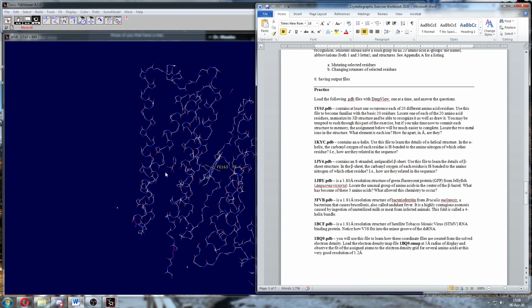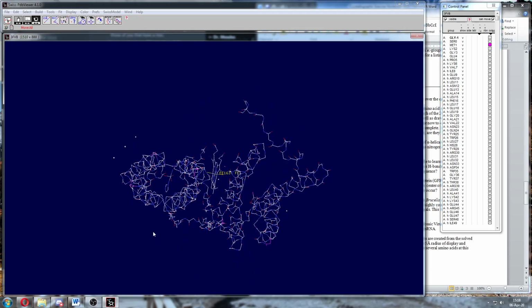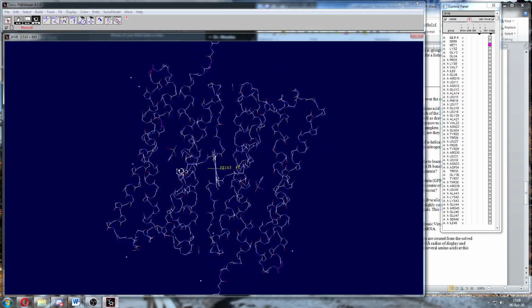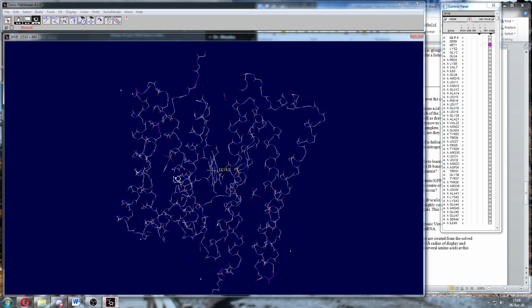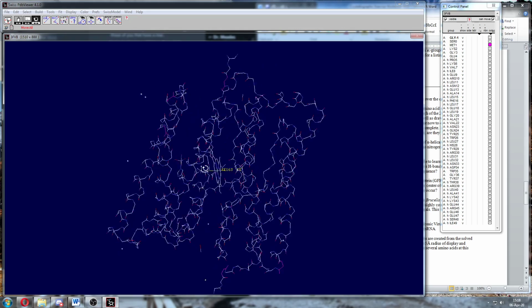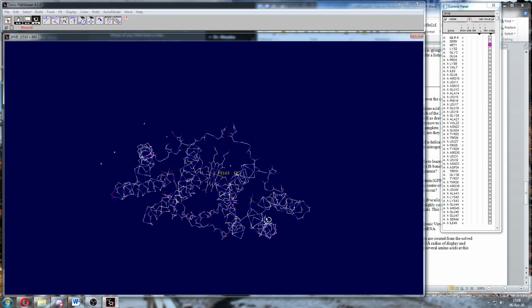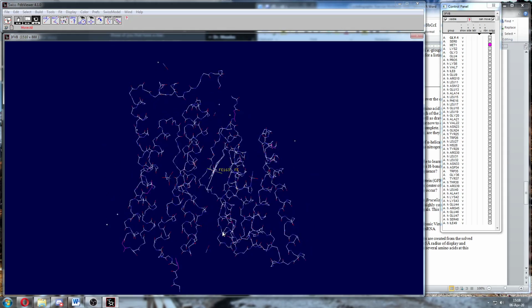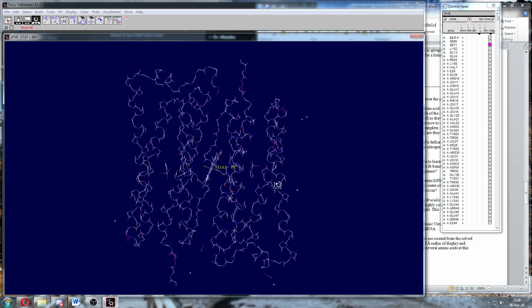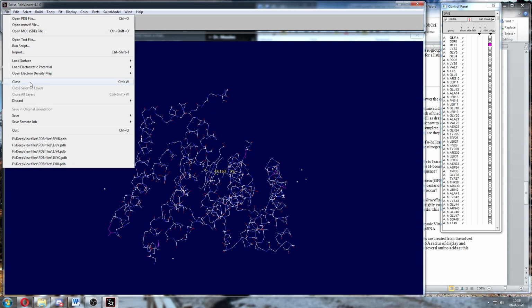Okay? So this is called a 4-helix bundle on the left. These 4 helices form a bundle. You notice alpha helices are not straight. They have a slight bend to them. And they cusp around each other, and they form these bundles. There's another 4-helix bundle on the right. And this pair forms a great way to bind things like this heme group in the center. Okay. All right, one more to go.